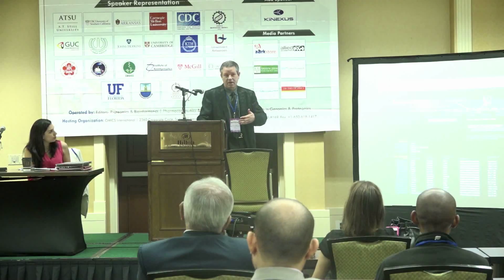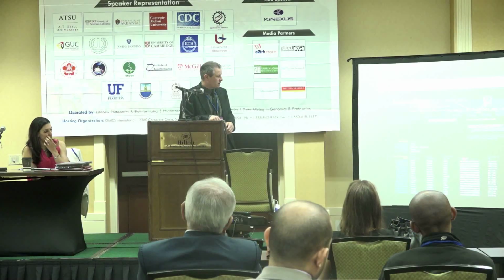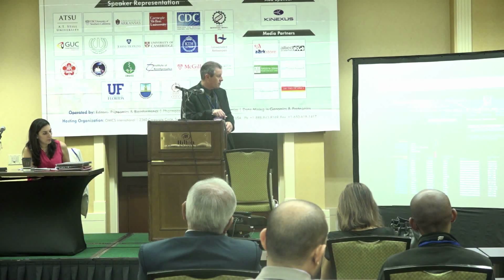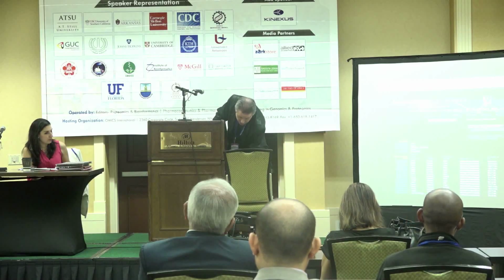Now you can go to mass spec, but it's nice if you can identify some potential players where your target site can be compared to those, out of the 1 million sites, that have the closest sequence. This is what PhosphoSitePlus match looks for. Then you can click on these proteins and get more information about each of those proteins and their phosphorylation sites.